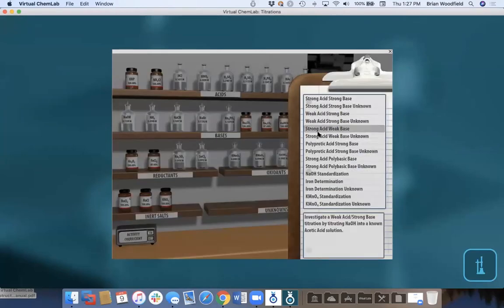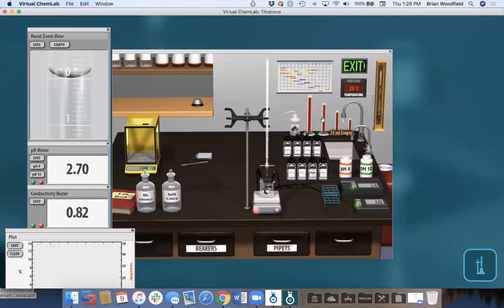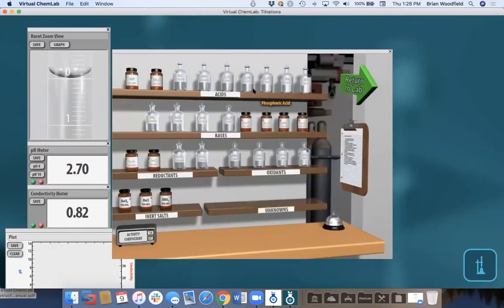I mean, you don't see the simulation. It's in our engine that drives our simulation. So for example, if I did a weak acid, strong base one, right? I can titrate or mix any acid with any acid or any base with any base. I have triprotic acids and tribasic bases, so I can do any combination of those, all right?